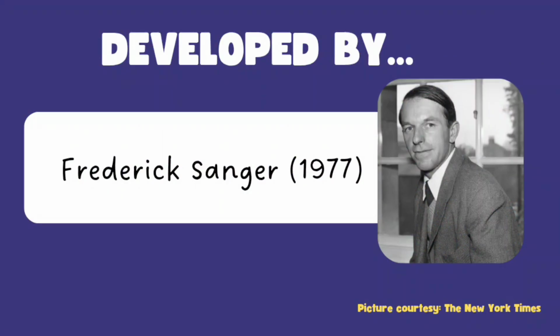In this video, we will explore how Sanger sequencing works, why it is called the chain-termination method, and why it's still used in labs today despite newer methods. Let's decode DNA one base at a time.